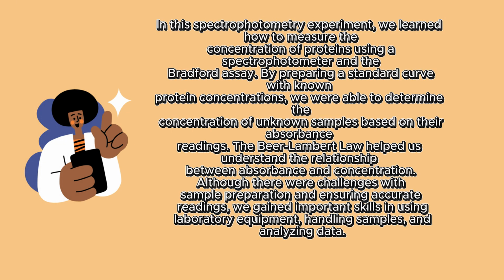In this spectrophotometry experiment, we learned how to measure the concentration of protein using a spectrophotometer and the Bradford assay. By preparing a standard curve with known protein concentrations, we were able to determine the concentration of unknown samples based on their absorbance readings. The Beer-Lambert law helped us understand the relationship between absorbance and concentration. Although we were challenged with sample preparation and ensuring accurate reading, we gained important skills in using laboratory equipment, handling samples, and analyzing data.